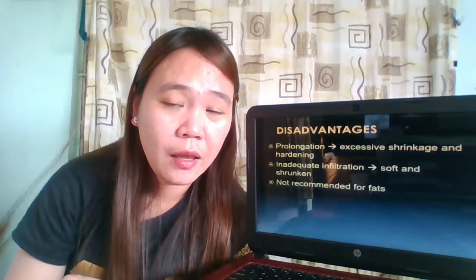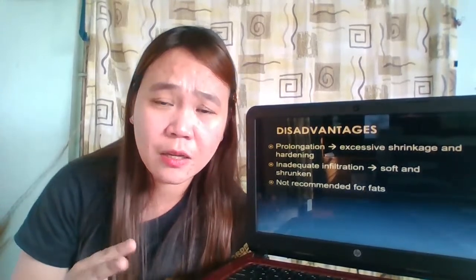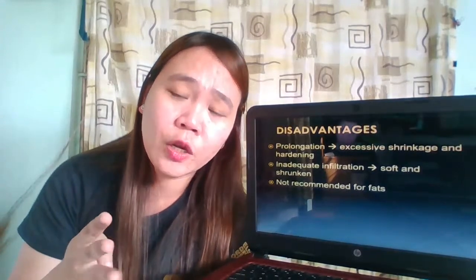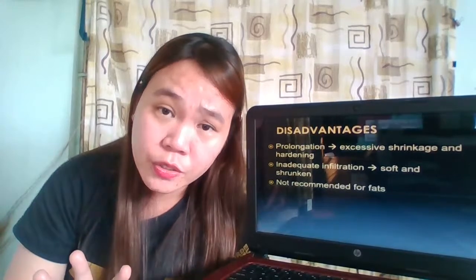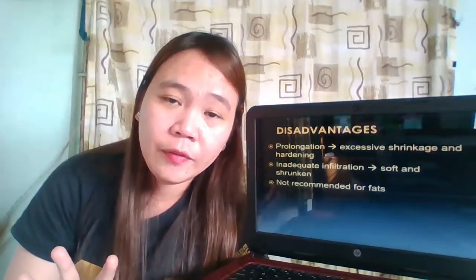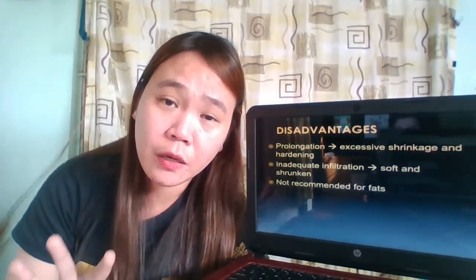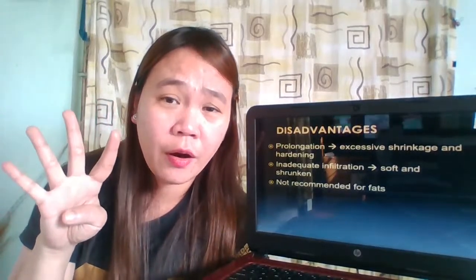Got it? Okay, prolonged immersion should not be done with paraffin impregnation. That's why, if you look at the other media that we use for processing samples, there are specific media which are actually recommended for this group.